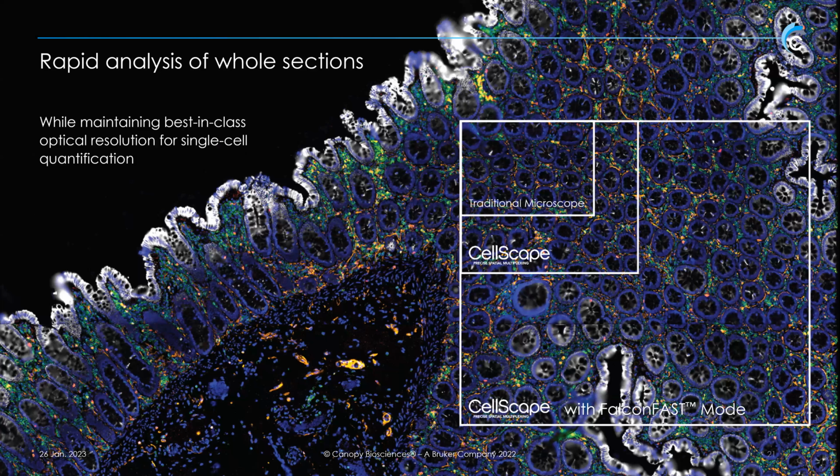The other thing to point out is that getting higher resolution is not, relatively speaking, magical, especially for microscopy. Go up in higher magnification, you're getting higher resolution, to a point, of course. What's cool is that with other changes in the optical train, we've been able to maintain the speed that you get with a low magnification, but still give you the spatial acuity.